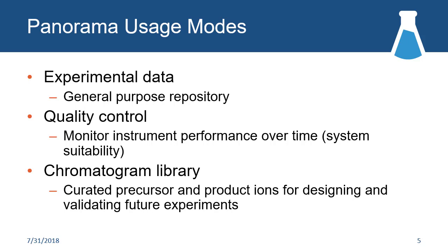You can curate a set of Skyline data for a given instrument and a given species, for example, to produce the canonical version of a chromatogram that you can then use to score future samples against in Skyline, as a way to let that initial setup inform your downstream analysis.